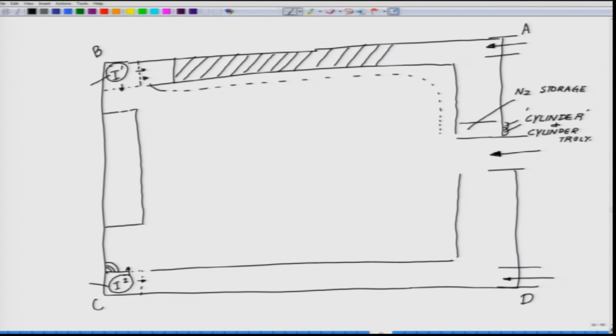Next important thing is that you have to have a sink along with a shower. This is a call we have to make. So, you probably want to have a sink somewhere out here before you enter the main area, so you want to have a sink and a shower.